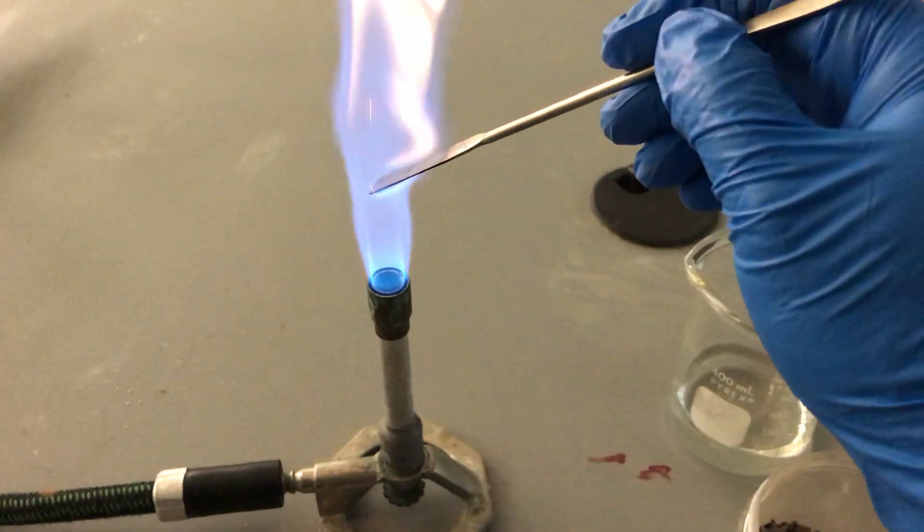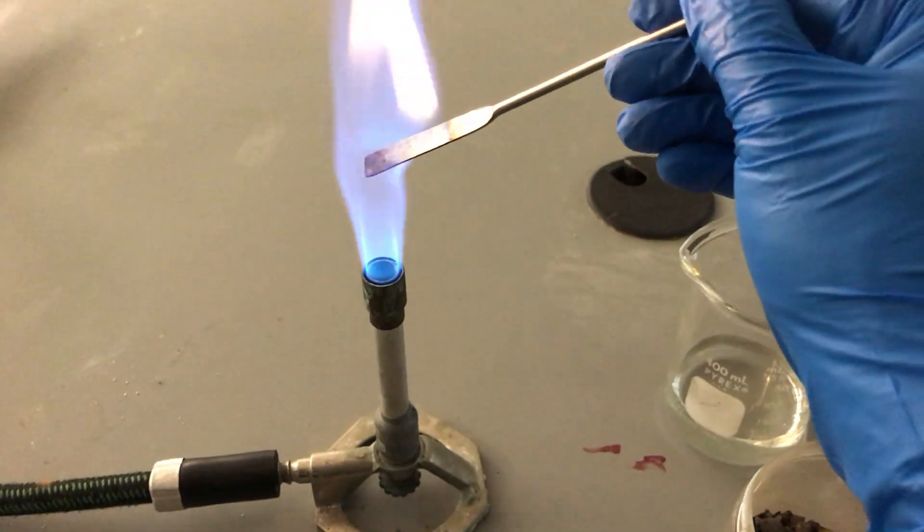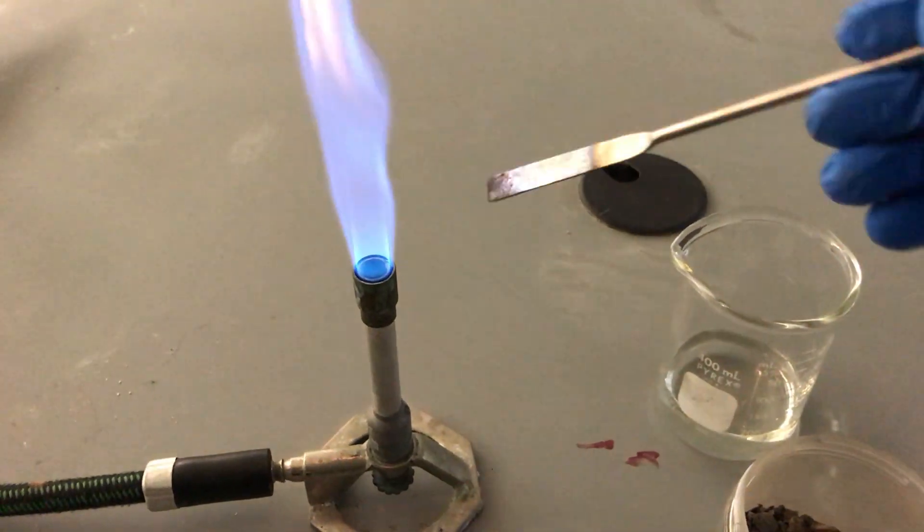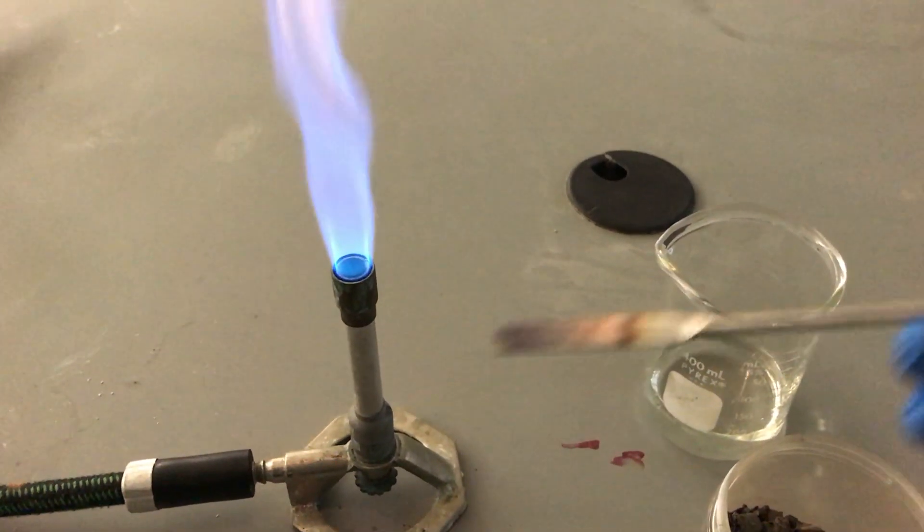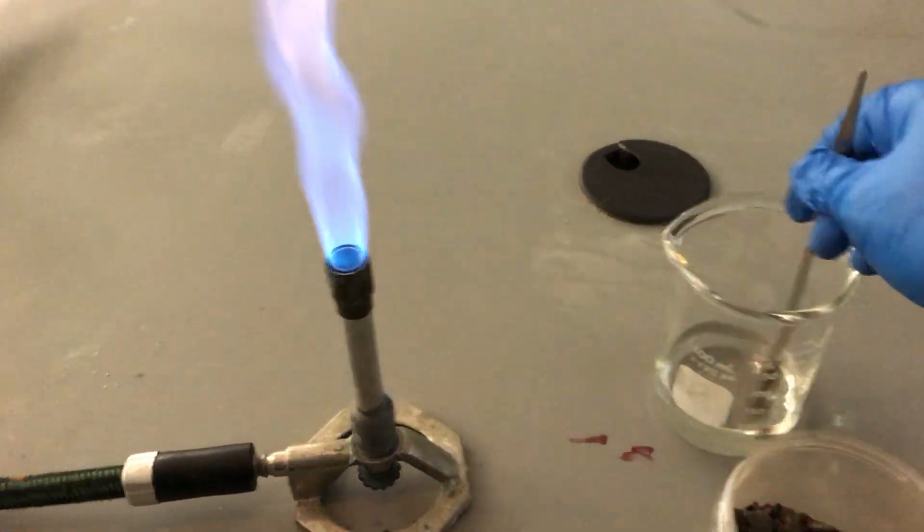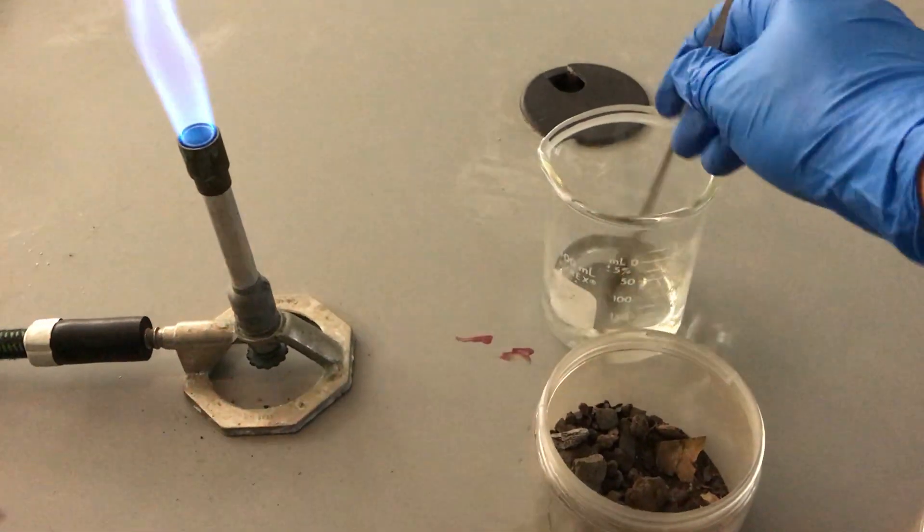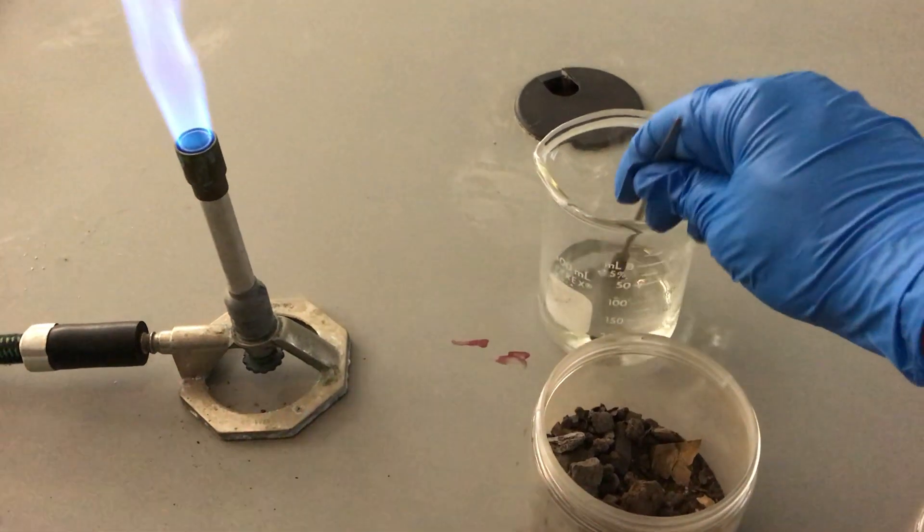But one thing we know for sure is that our crime scene sample has both orange color and sparkles in the sample. We're going to reintroduce this to the nitric acid, swirl it around a bit, get any contamination off.